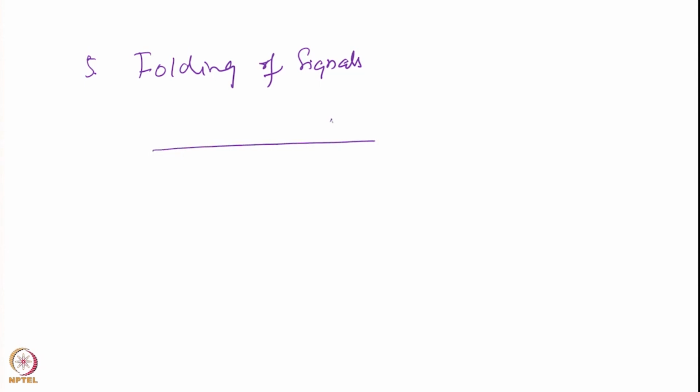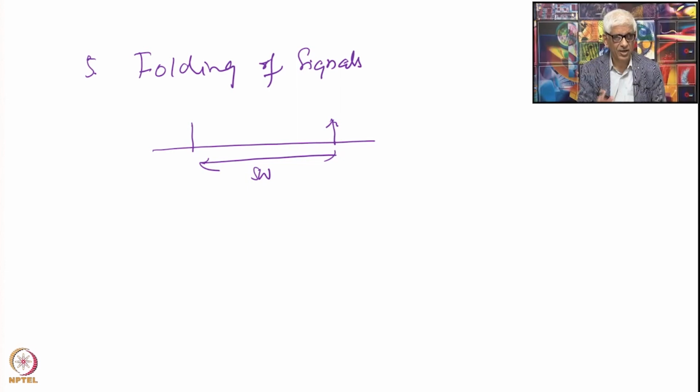Suppose I choose a carrier at this point and my spectral width up to here. I chose this spectral width because I chose a dwell time according to that. This is what I assumed has the largest frequencies, because a priori you do not know the range of your frequencies. You arbitrarily choose some numbers, that my frequencies are supposed to be present within this area.